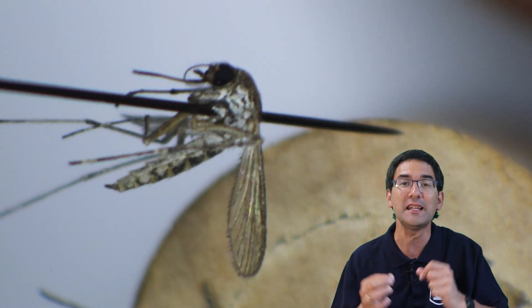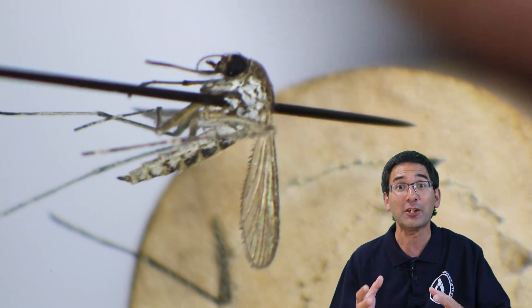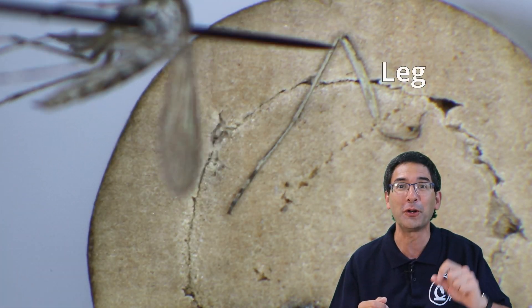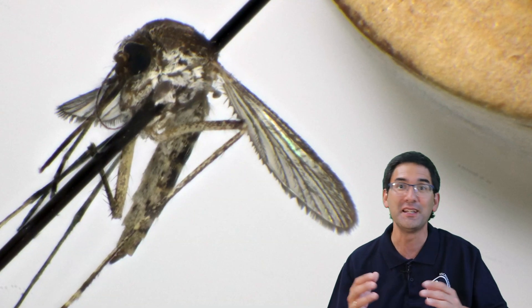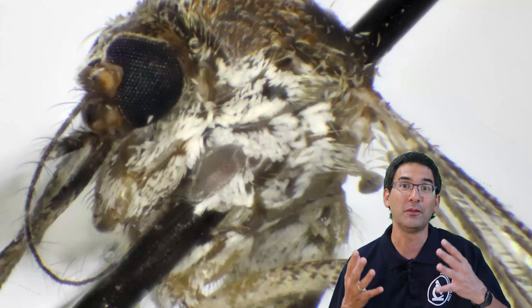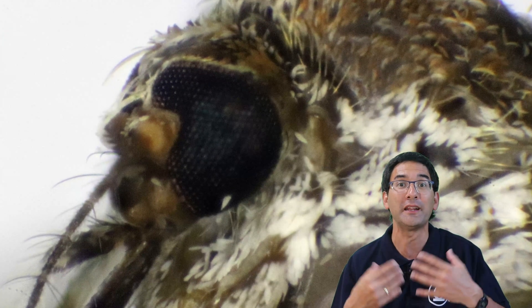So I decided to use so-called entomological needles — very fine needles that insect researchers use to pin their insects. This was successful: I was able to pin the insect on a piece of cork, which allowed me to rotate and manipulate it better and get much better images. We can see that the insect is covered in lots of scales, and we're going to have a closer look at them later under the compound microscope.